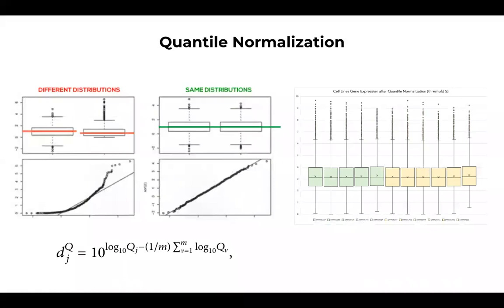So there are different distributions which we looked upon, and after doing logarithmic normalization, we learned about quantile normalization. So here you can see the box plot after doing quantile normalization, how the means are now much better aligned. So quantile normalization arranges expression values in similar order between samples and aligns their means. So you're seeing the alignment of means here.